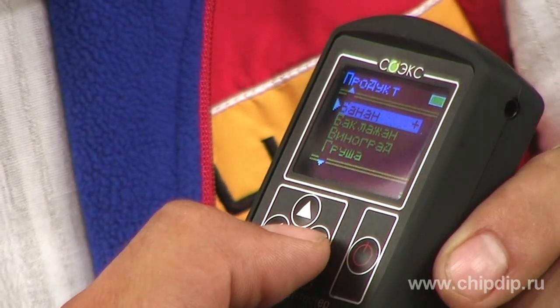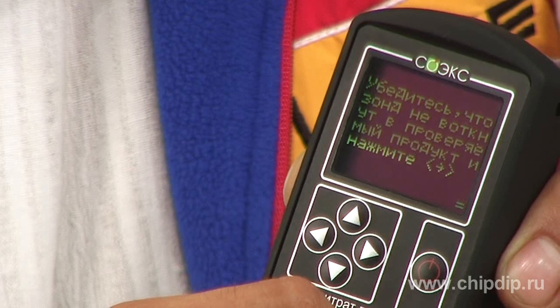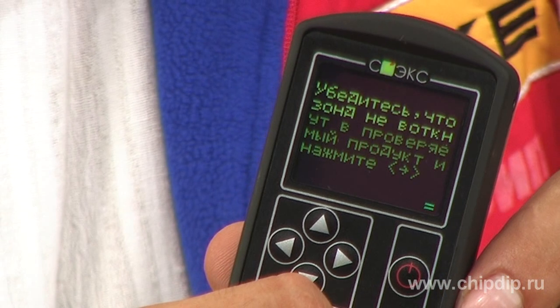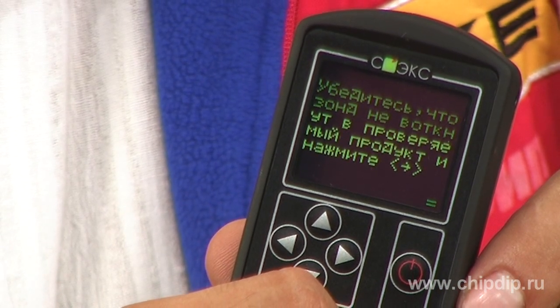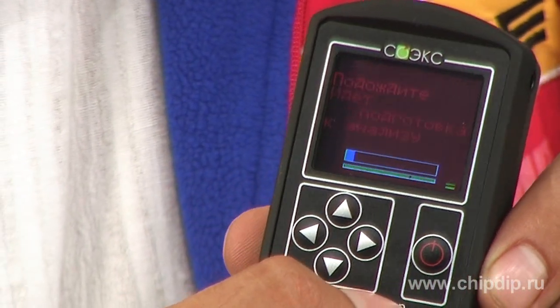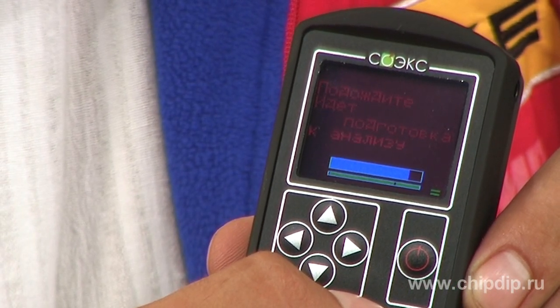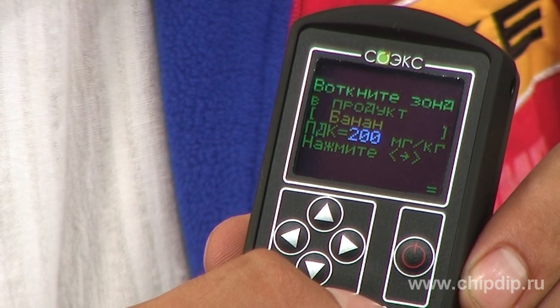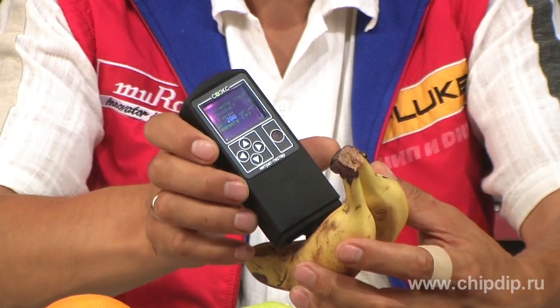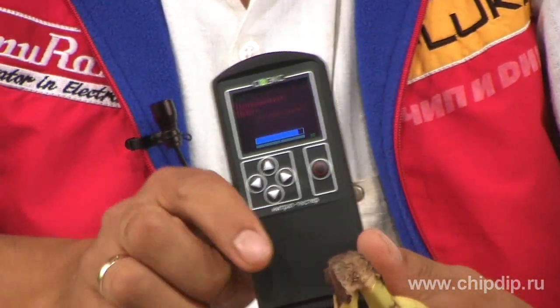In our case, I want to check these bananas. The screen shows the text: make sure that the probe is not plugged into the testing product, and click Continue. The tester self-calibrates and displays the information saying the device can be stuck into the measuring product. We stick the probe and click the Continue button.